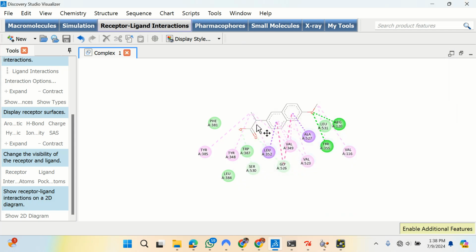You can see I'm not using a mouse; if I were, I could zoom in closer. You can see the arginine has a green dot, telling you it is bonded here. See another green dot bonded to this, and valine bonded by this. The legend I just removed is what you use to interpret the types of bonding.